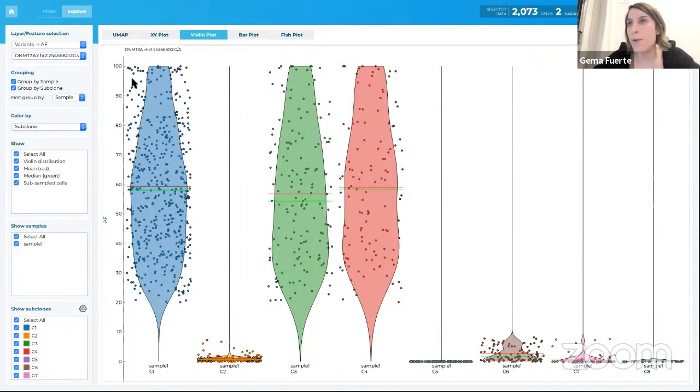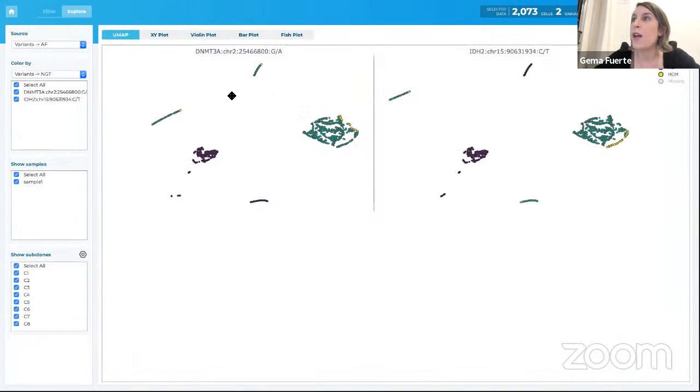For the sake of this demo, I'm not going to give you additional information on this window, just so you know this is available. And perhaps we can have a different session or a follow-up session to go more in depth on these filters. So back to the UMAP space now, we know that we could potentially analyze these single clones further, but in this case, I will only focus on the 2 larger clones for this quick demo.